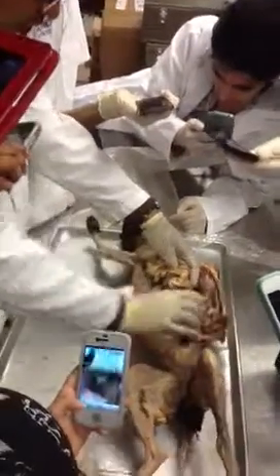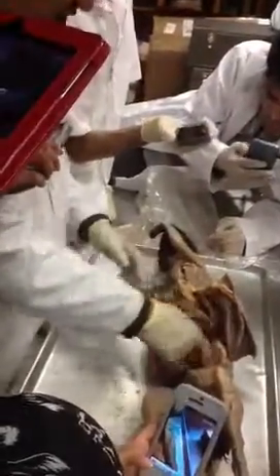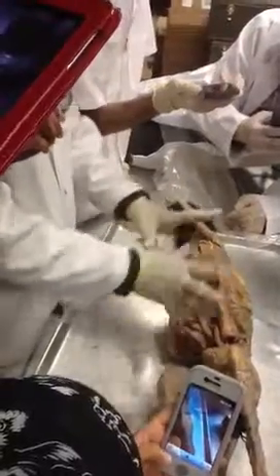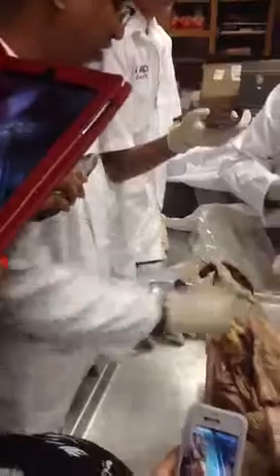We have got other things to do, and next day if we have got time, we'll actually dissect and go deep inside, and we'll try to see the reproductive system and figure out whether it's a male cat or female cat.